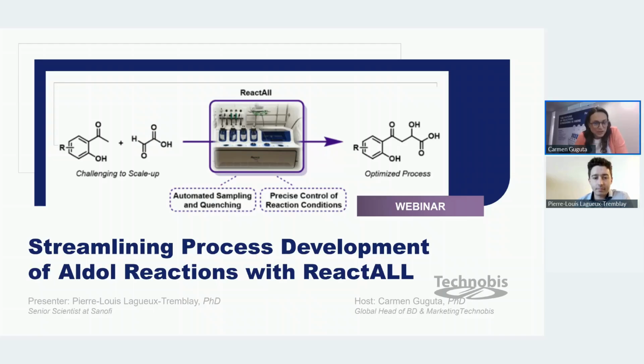The webinar today will be on streamlining process development of Aldol reactions with the ReactALL.